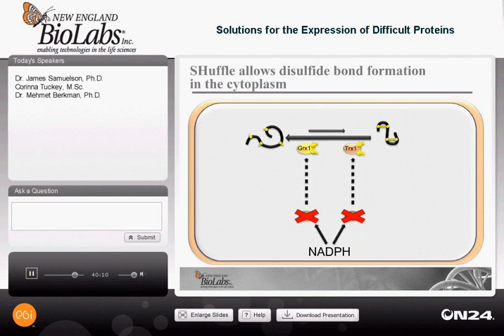We then select for suppressors that restore viability to these dead cells. And once we've investigated and mapped those suppressors, we found that they mapped to another pathway, the peroxidase pathway. AhpC is another reductase, well, it's a peroxidase, that scavenges hydrogen peroxide away from the cytoplasm. And the mutant version of AhpC, which was a suppressor of our lethal strain, lost its peroxidase activity and gained a reductase activity.